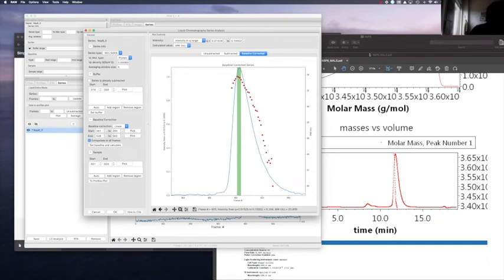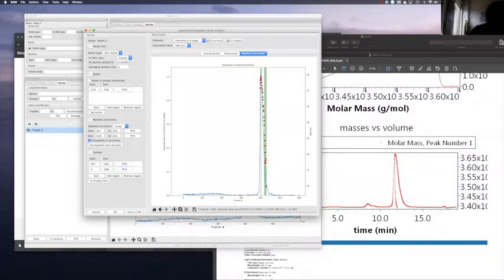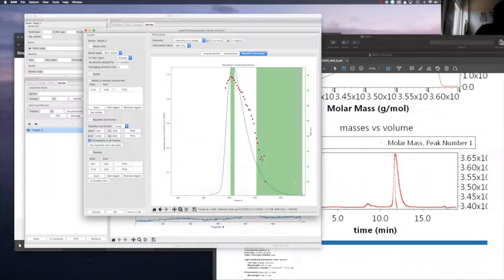Let's also select the size of the peak, add the region, and select just the side where it's mostly the monomeric state. Just make a little better selection here. We need at least some signal, because here there is no signal at all, so there will be no SAXS, obviously.